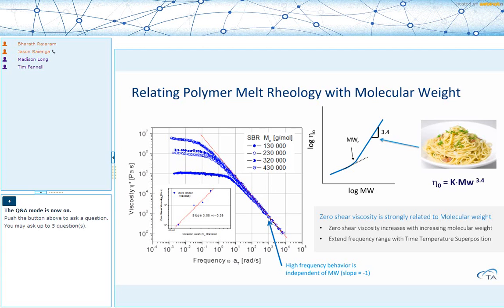Another thing with the melt flow index is worth pointing out here. Melt flow indices are inherently constant stress-based measurements, but viscosity, as we've seen for polymer melts, is non-Newtonian. So it is probing at different shear rates, and the application extrusion processes are always rate dependent. You're moving the product through the process at a constant rate. So a melt flow index is going to probe at different points along that curve instead of giving you a point at exactly the same shear rate when you're comparing different materials.